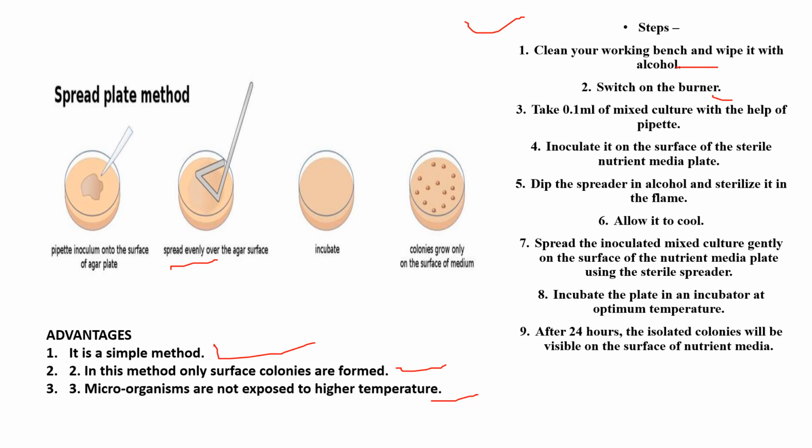Disadvantage of this method is we cannot isolate those microorganisms who need below 6% of oxygen, means microaerophilic organisms. We can isolate microaerophilic organisms only using pour plating technique.